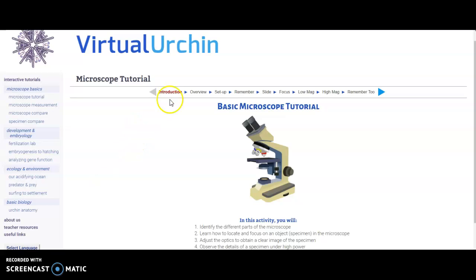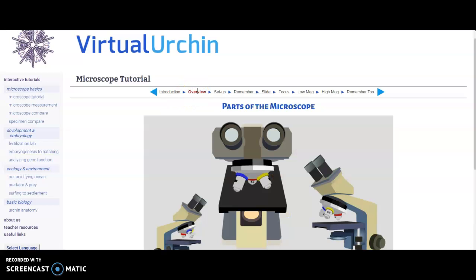Okay, so I'm going to go through each of these key items here. These labels up at the top are the different components of this microscope tutorial. So in this activity, you will identify the different parts of the microscope, learn how to locate and focus on an object or a specimen in the microscope, adjust the optics to obtain a clear image of the specimen, and finally observe the details of a specimen under high power. Okay, so we're going to skip right ahead to the overview.